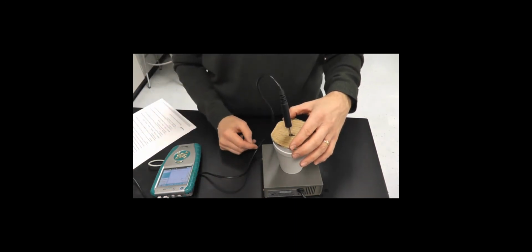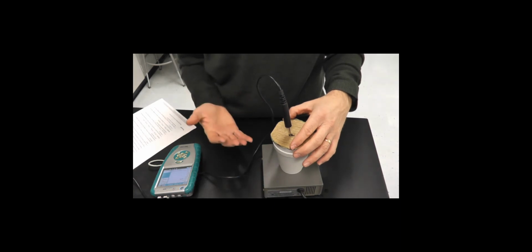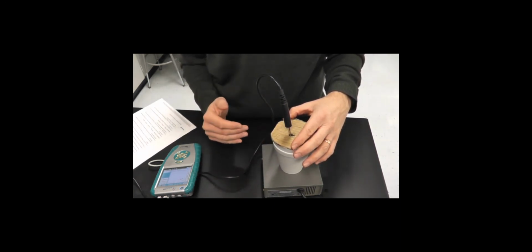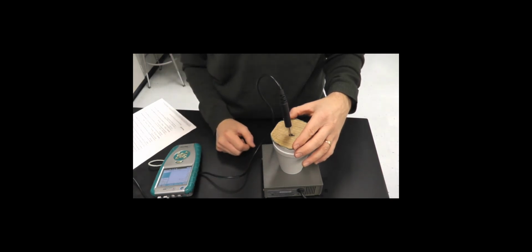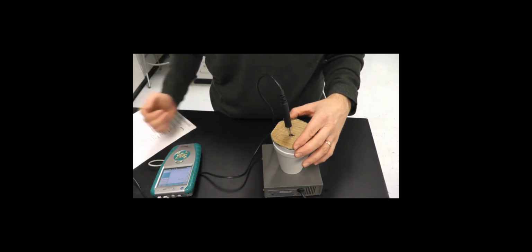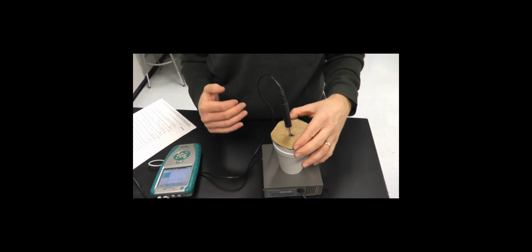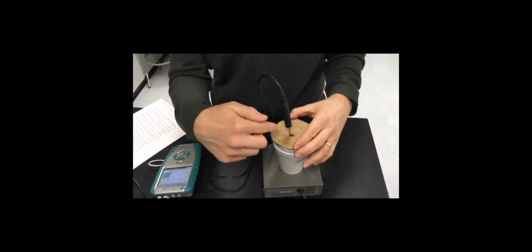But what's going to happen is my styrofoam, even though styrofoam is an insulator and should not absorb any heat, still does, or just the air around my calorimeter. So this first step is simply to find the heat capacity of my styrofoam cups, or my system. It's basically a correction factor for part two of the lab. So part one of the lab is simply finding the heat capacity of my calorimeter: my styrofoam cups, the cardboard on top, and just the air that's trapped in here.